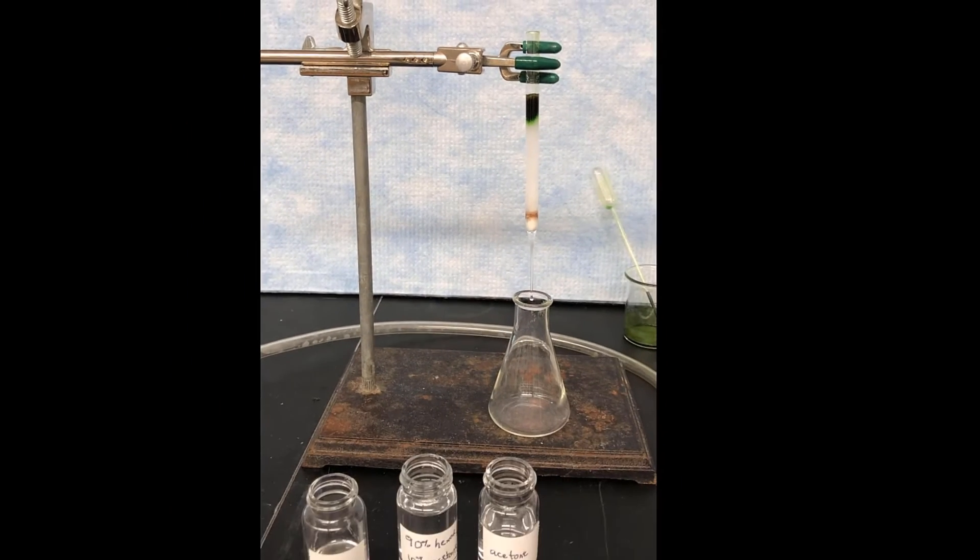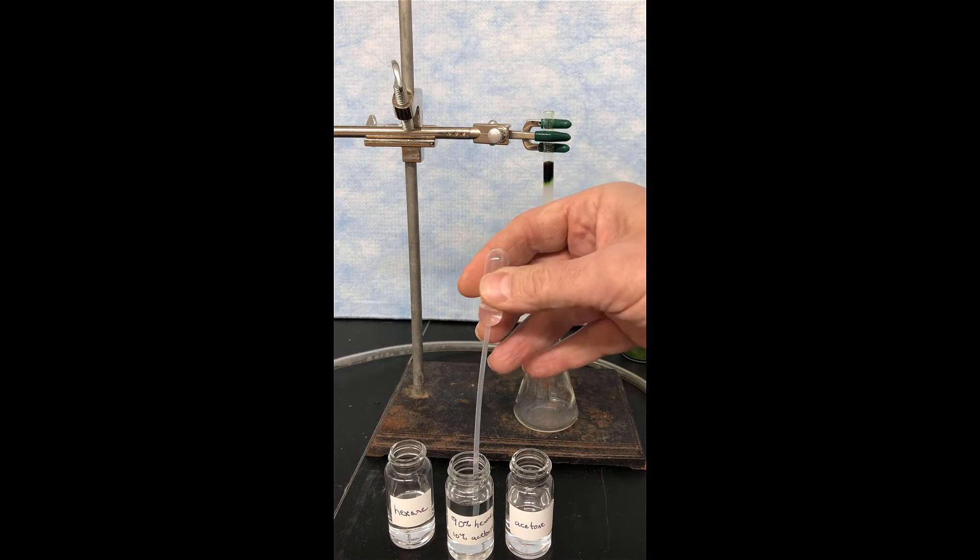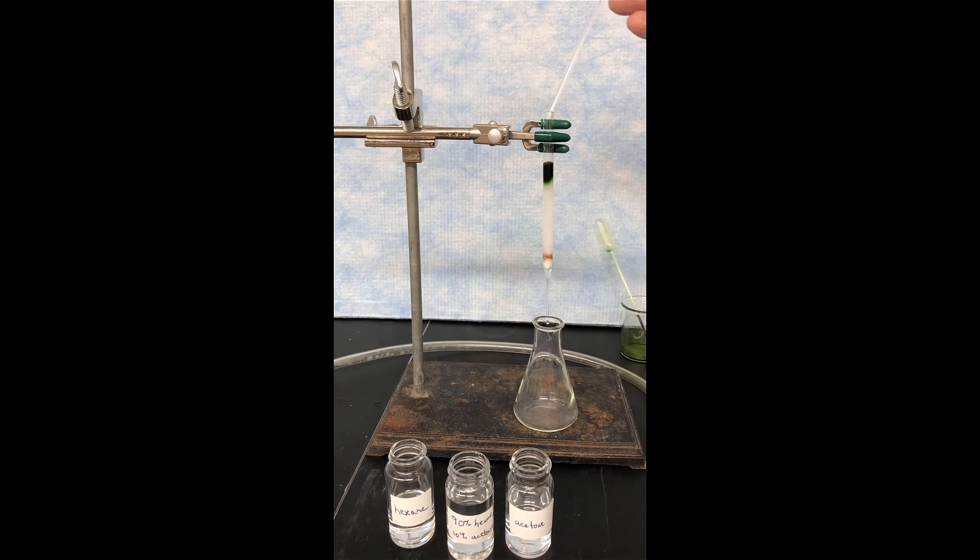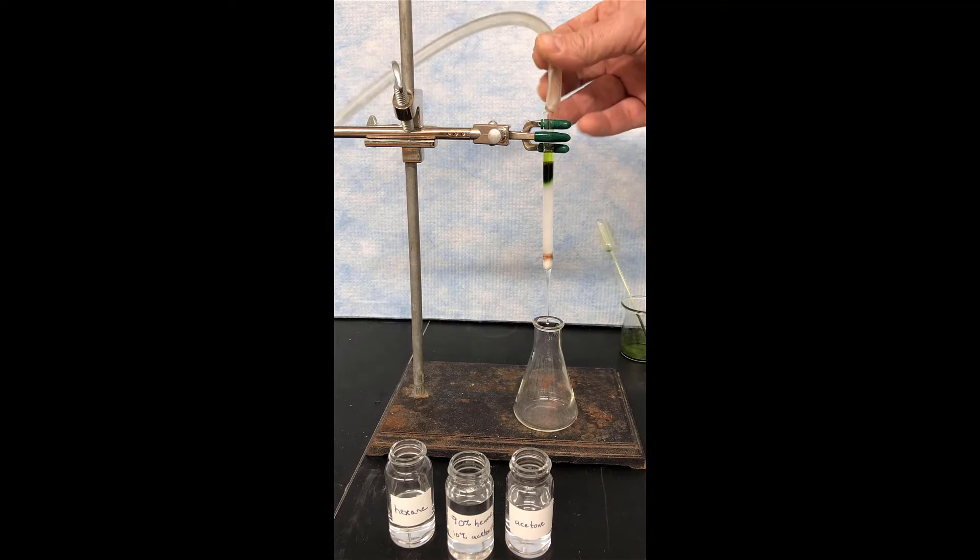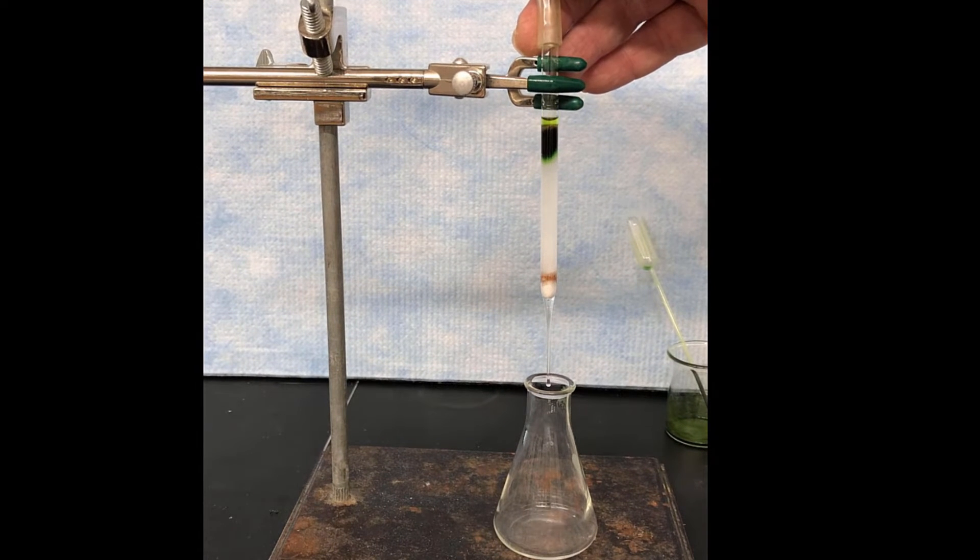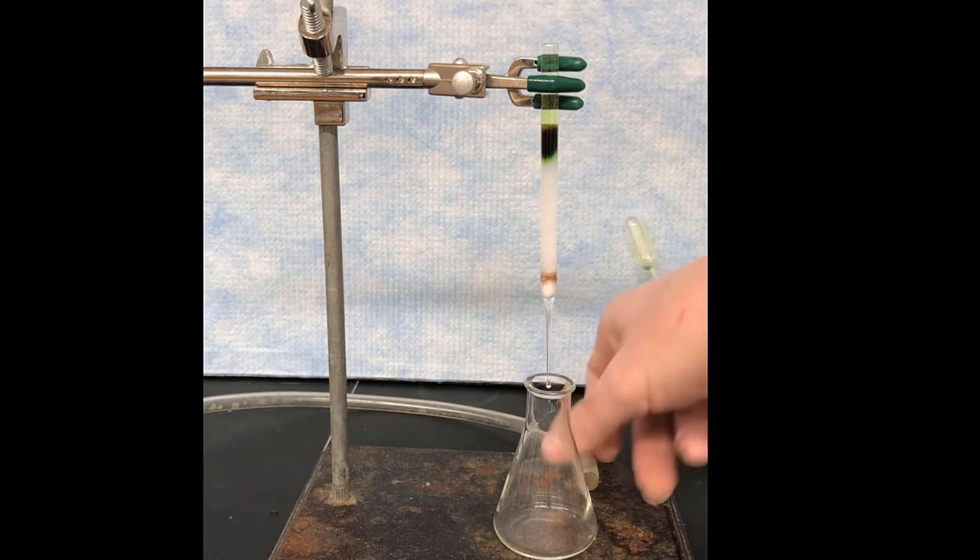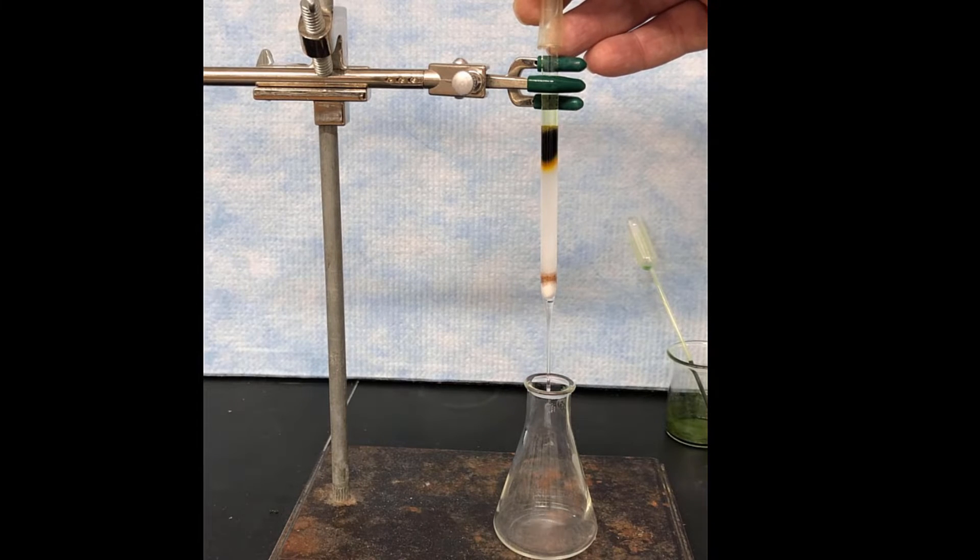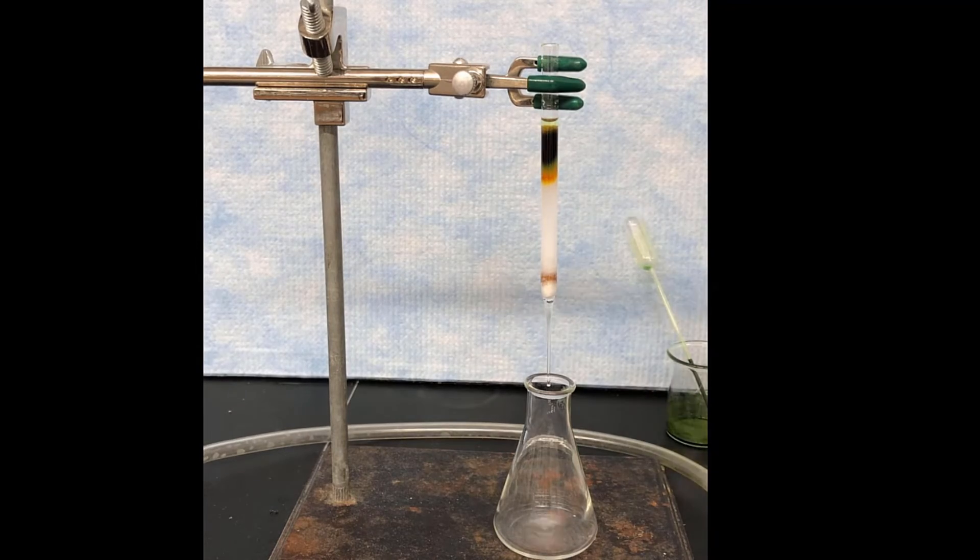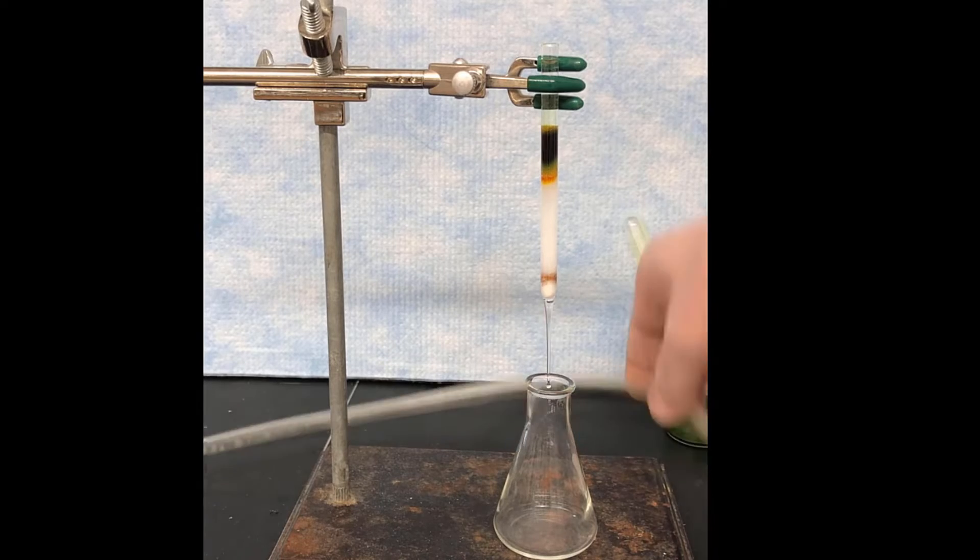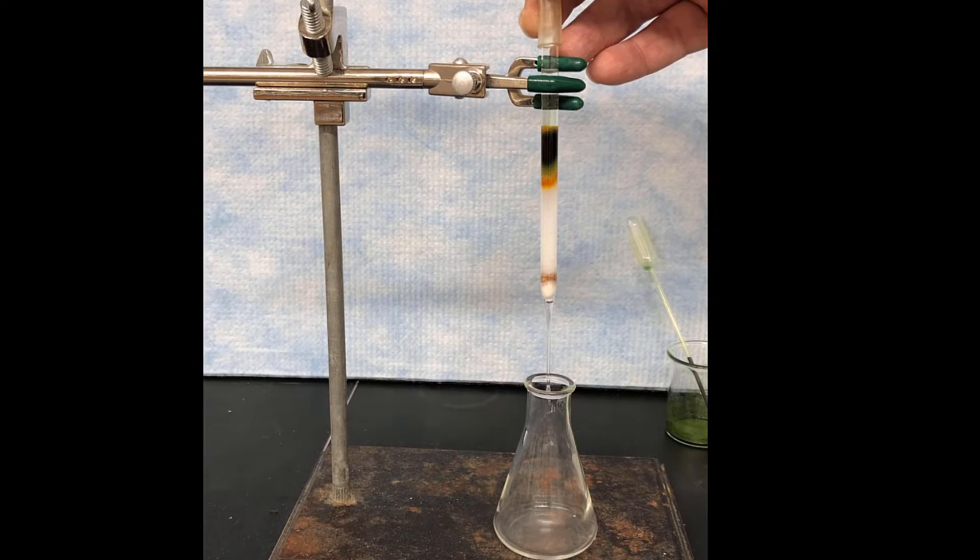Then we'll be ready to start eluting the column, and we're going to do that with the 90-10 solution of hexane to acetone. So that gets pipetted on, and then when that gets flushed through with the compressed air, the pigments will start to move. So what you'll be able to see here is there's a yellow band that's going to start moving out in front. Now that is the beta carotene fraction. So beta carotene is the least polar thing in the pigments, the spinach pigments, so it moves the fastest on silica gel.